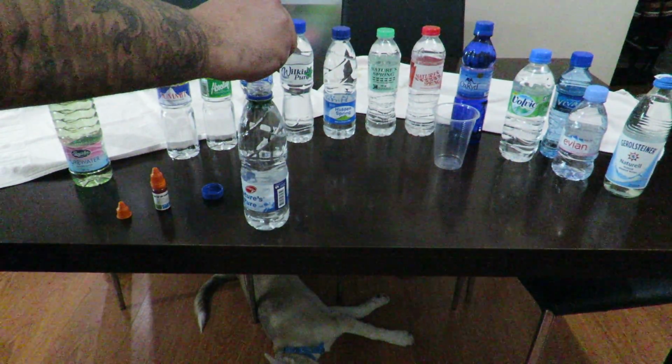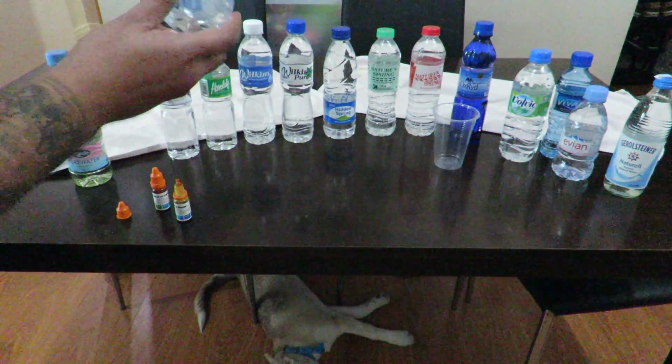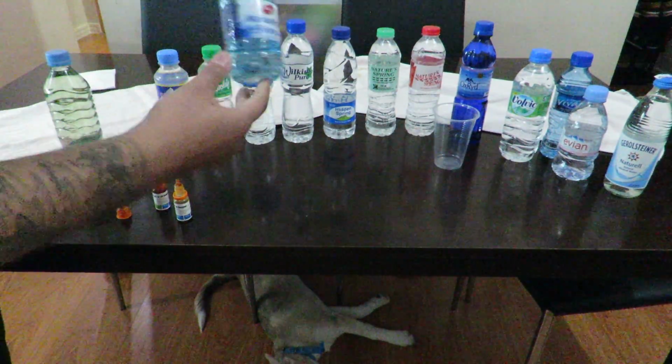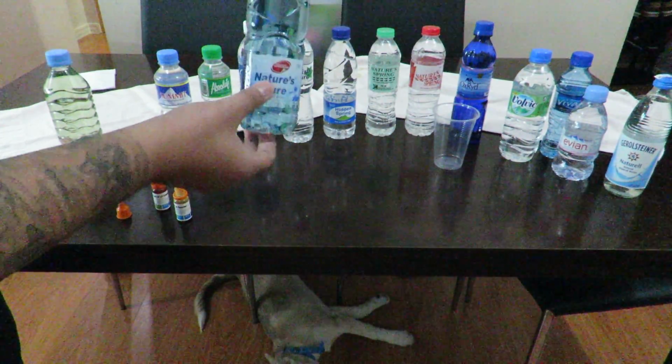So this one here is Nature's Pure, which is a Robinson's brand. And this is mineral water. Shake that, and we got some blue going on there. Nice color of blue. So actually Robinson's Nature's Pure is very good mineral water.